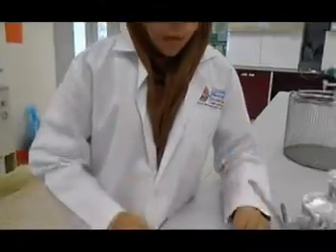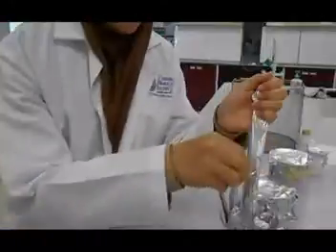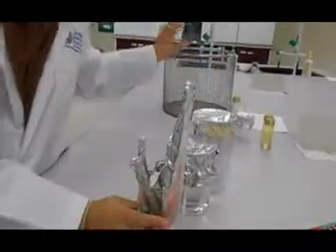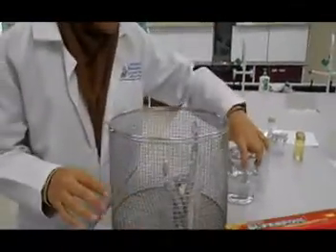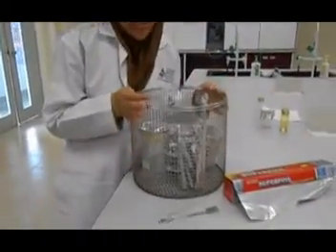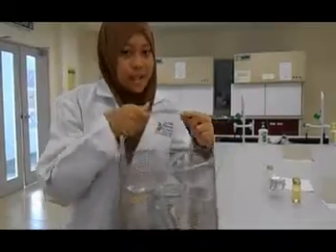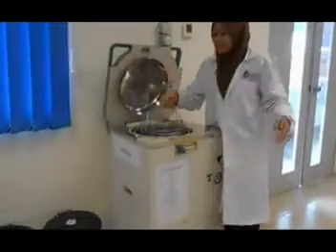So this is the example of lab apparatus that can be autoclaved using the autoclave machine, like glass rod, spatula, and dropper. But before you autoclave all these apparatus, you need to wrap them with the aluminium foil, like this. After that, you can put them inside this basket. This is the autoclave basket. Next, you can just put this basket and insert it inside this autoclave machine.